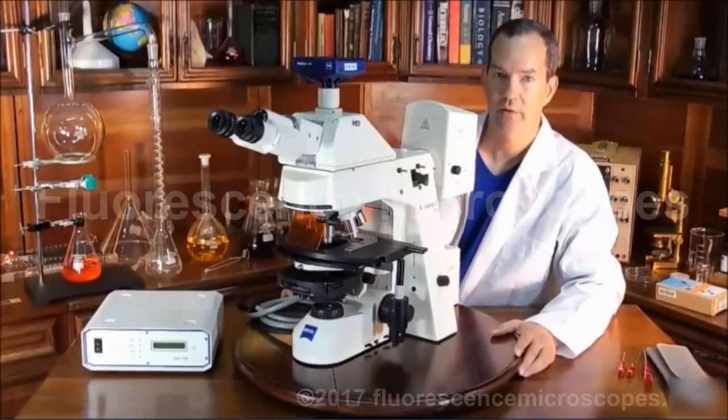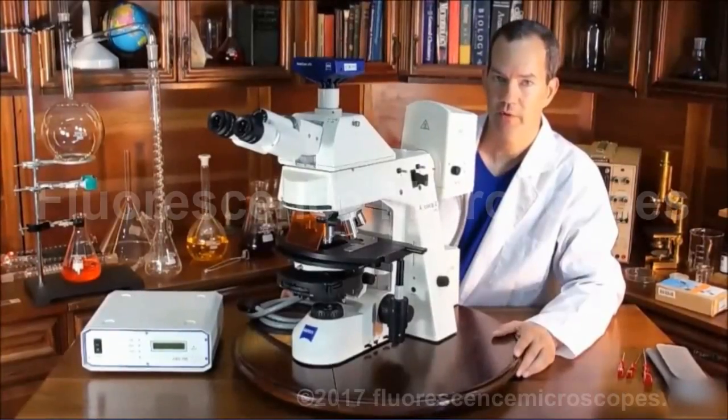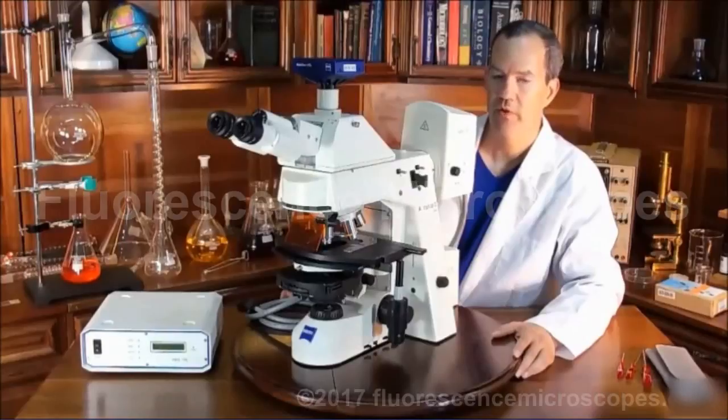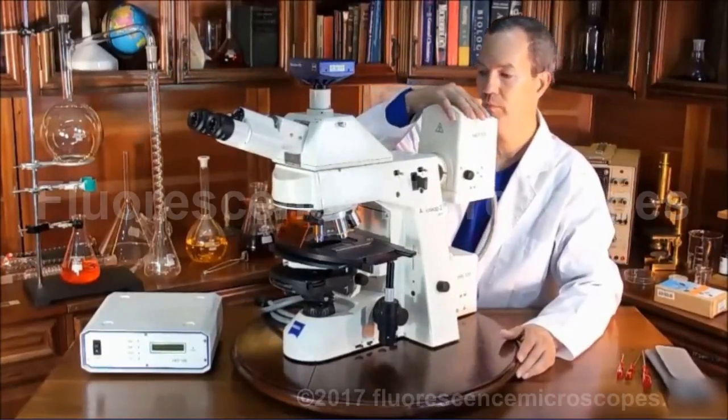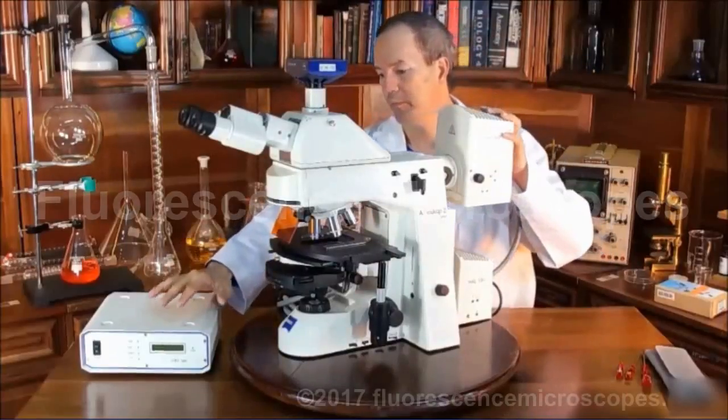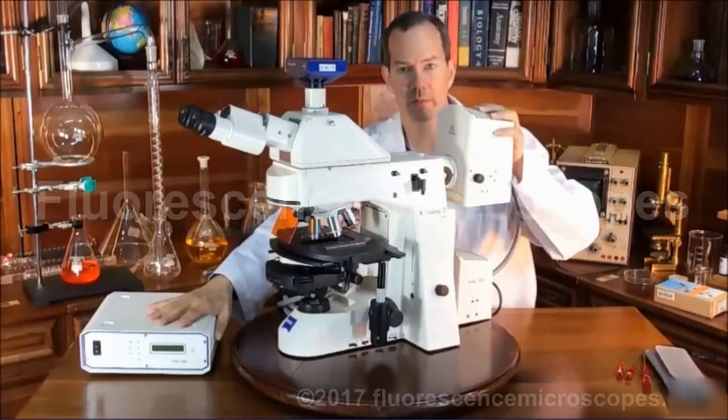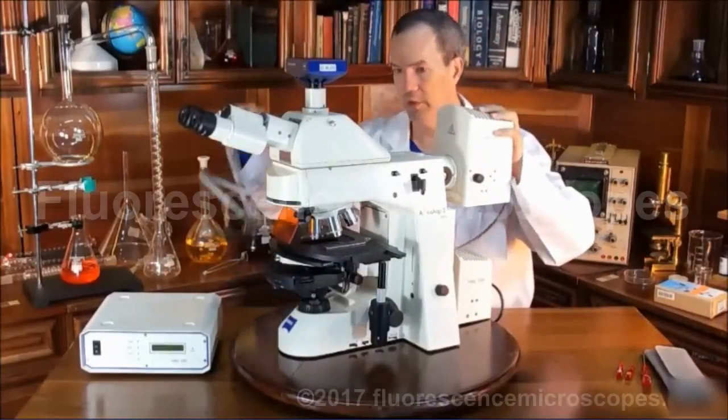This is a Zeiss Axioscope II upright fluorescence microscope. We've configured it with a 100-watt HBO mercury. This is the power supply, this is the lamphouser, and this is the cord that connects the two.